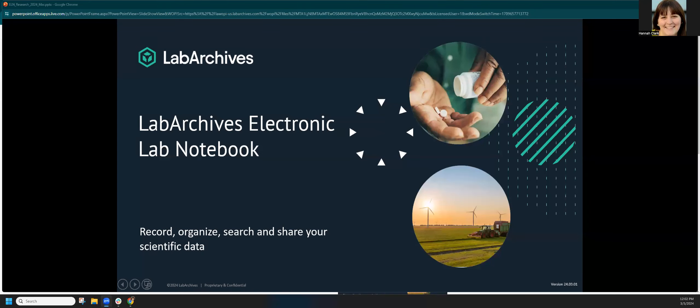Hi everyone, my name is Hannah Clark. I'm sharing my screen — feel free to ask questions throughout. I'll stop every so often and check chat as well. I'm a member of the Lab Archives team, and fortunately at Weill Cornell Medical you have access to an enterprise license for Lab Archives. Some of the folks on the call today are your site administrators, so for any local questions or policies they'd be happy to chat.